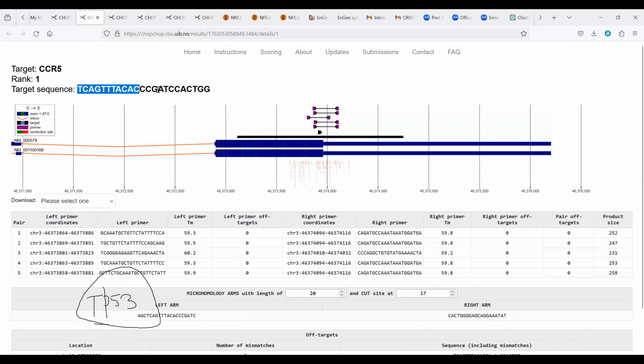You just take this sequence up to here, then the remaining scaffold sequence of the guide RNA, you patch it up, and you form the guide RNA. And you complex the guide RNA with the Cas9, and then you nucleofect the cells. So these will go inside, and then they will do the cleavage. All right. But that is not enough, because you need to knock in the gene that you want to knock in, which we have not considered right now. That will be in the repair template.